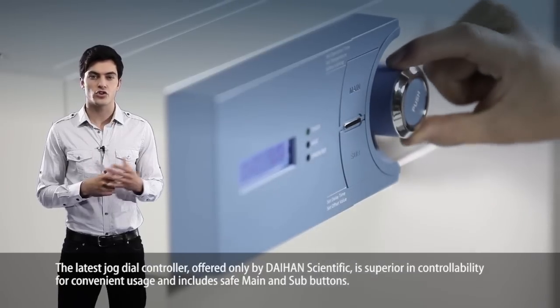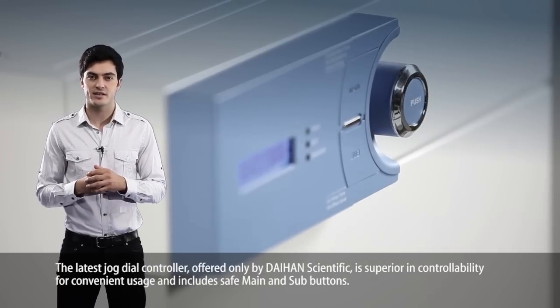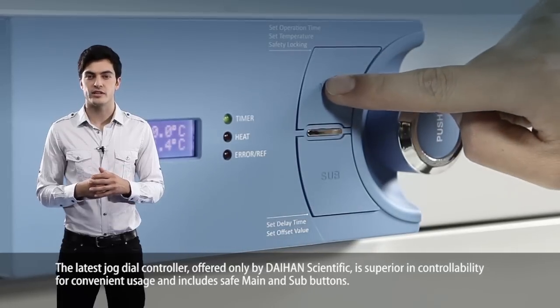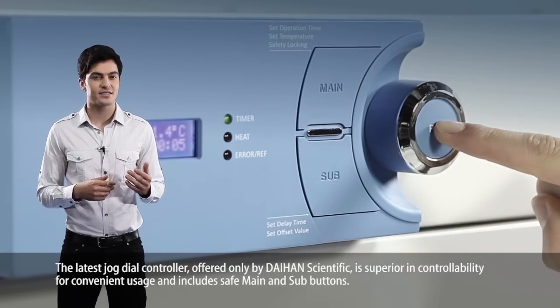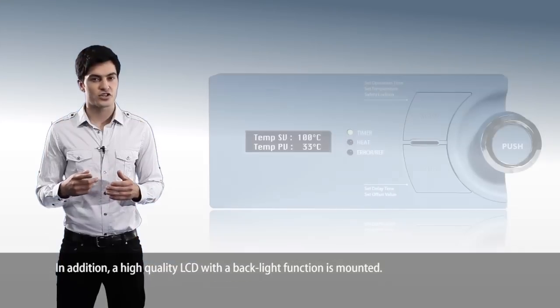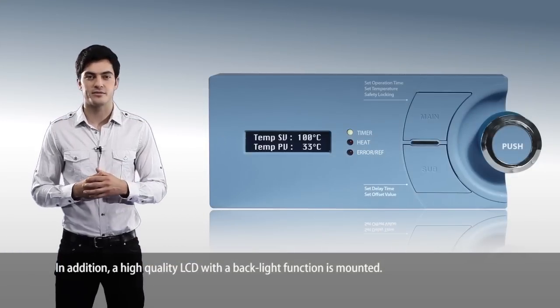The latest jog dial controller, offered only by Dayhan Scientific, is superior in controllability for convenient usage and includes safe main and sub buttons. In addition, a high-quality LCD with a backlight function is mounted.